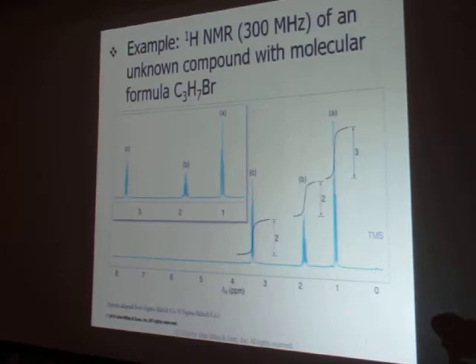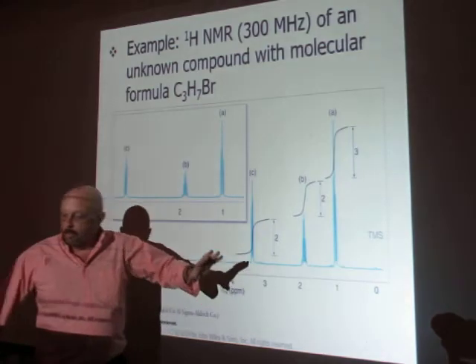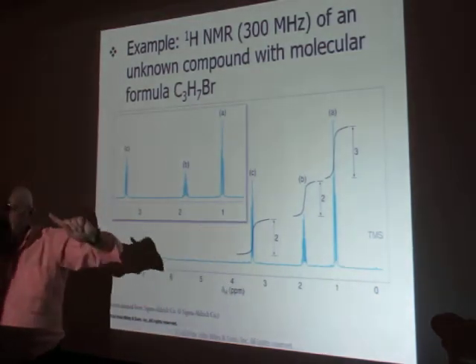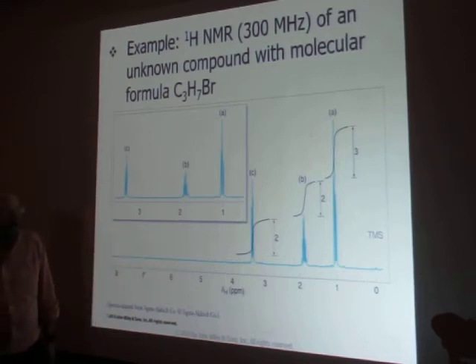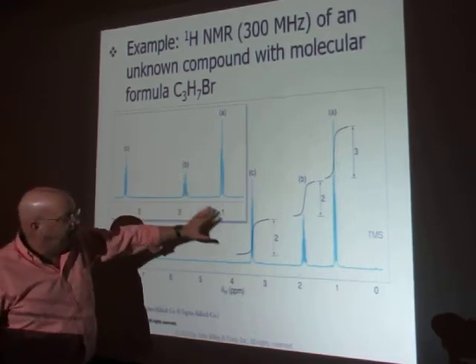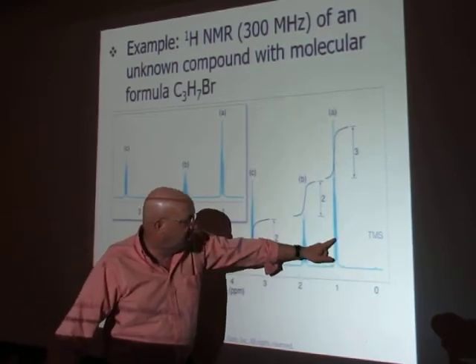So write that down. Now, I've got some pieces there. We're starting to form, but we can probably see a little bit more. Let's go to our splitting. Save the splitting to last. Now I have an expanded view up here so you can see these a little bit better. Let's look at this one we just did, the CH3.